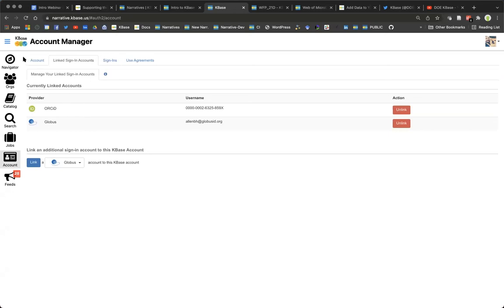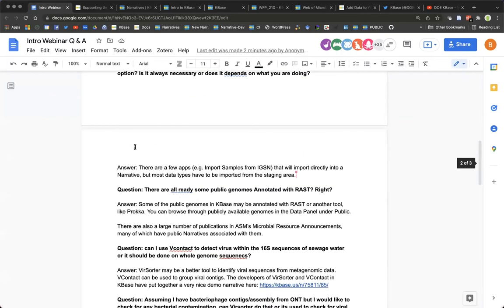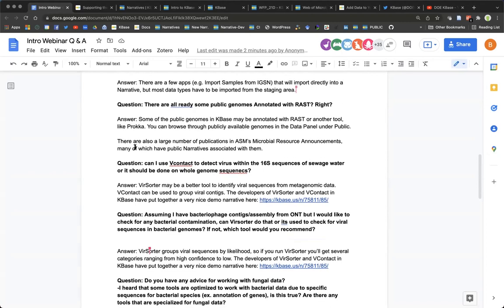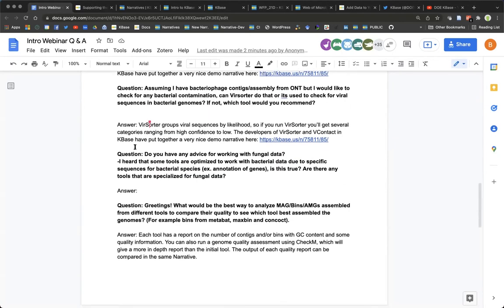So we're at the top of the hour here, and I've gone over quite a bit. I know this is a lot of information. I just want to check and see if there's any questions in the Q&A document that I can answer here that may not be answered. So it looks like folks have been answering those questions here.